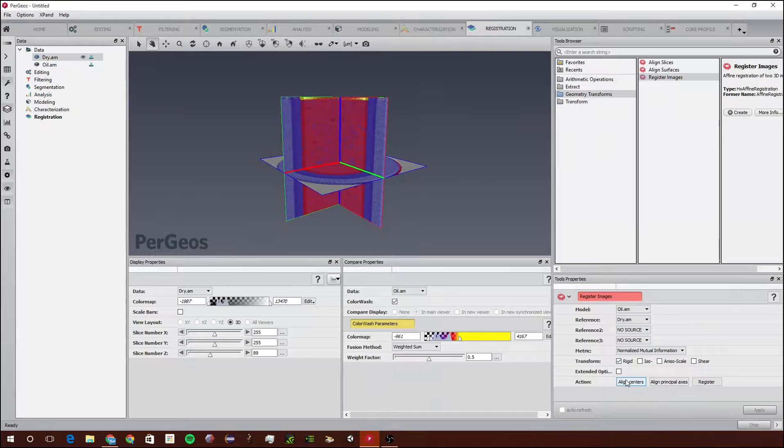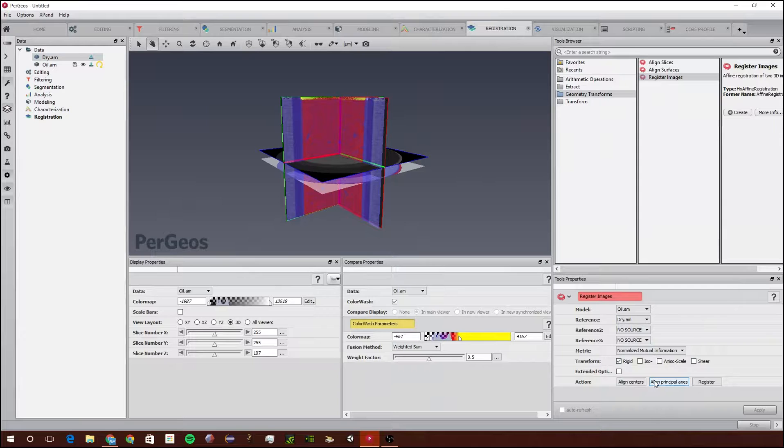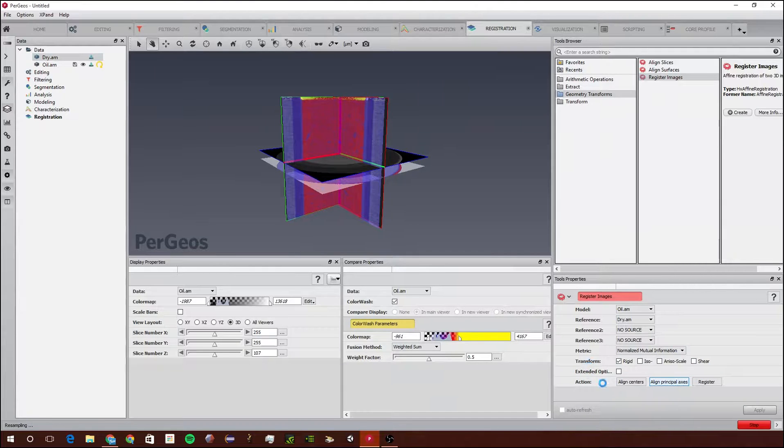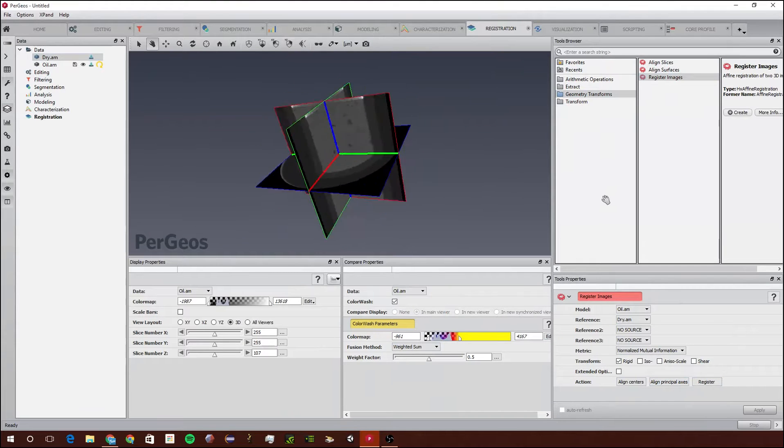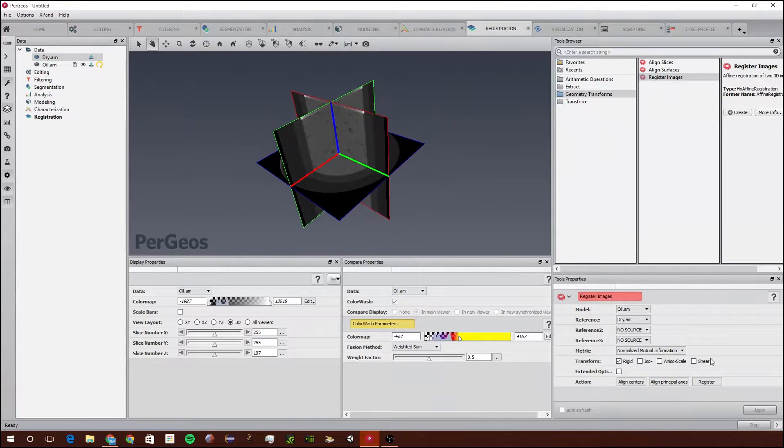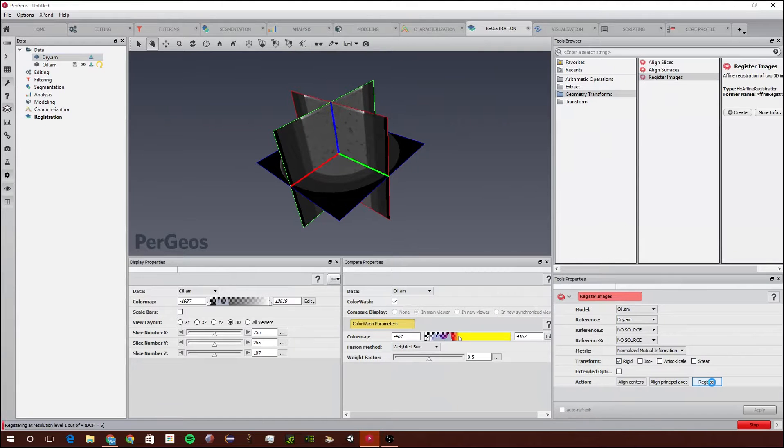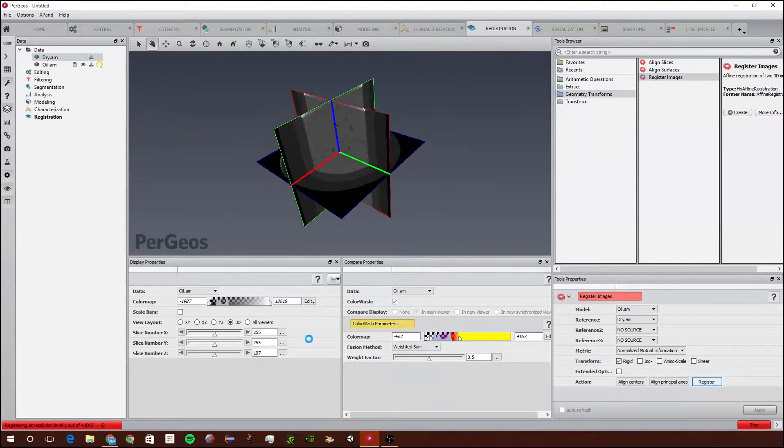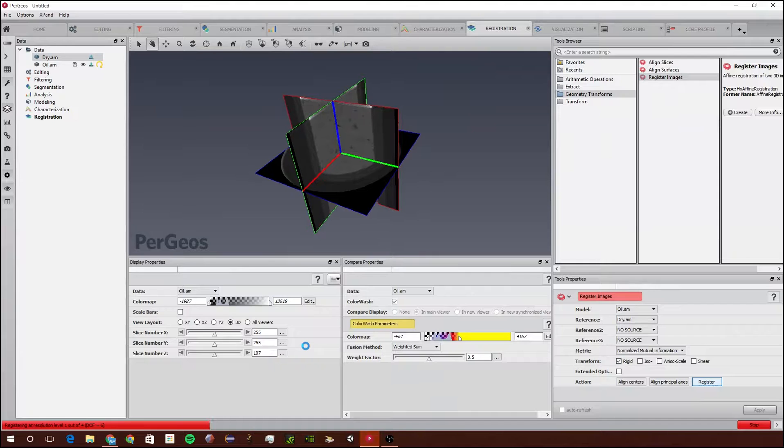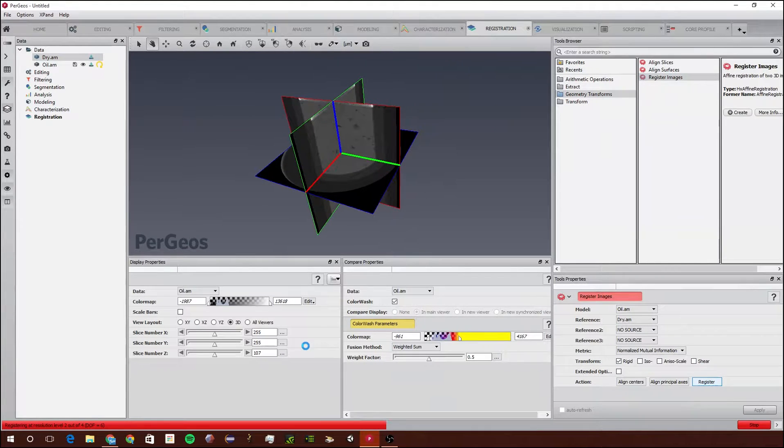We're going to click Align Centers just to make them more closely aligned, and we're going to click Align Principal Axes. Next we're going to click on Register, and as you can see it's computing all the different ways they could go together.